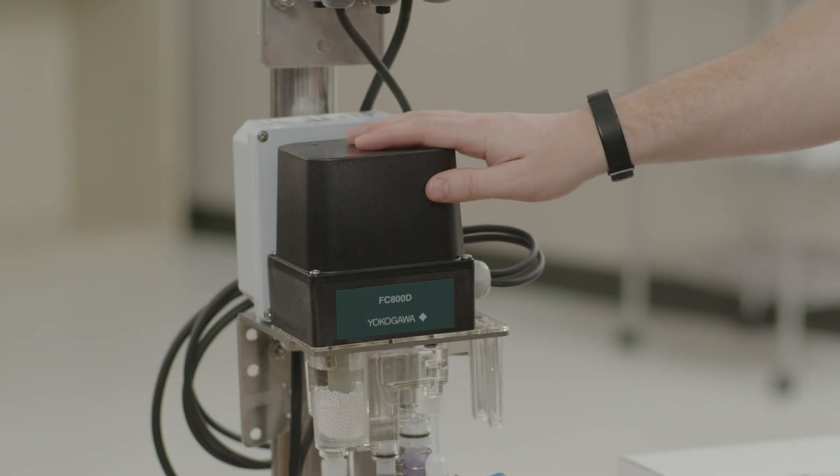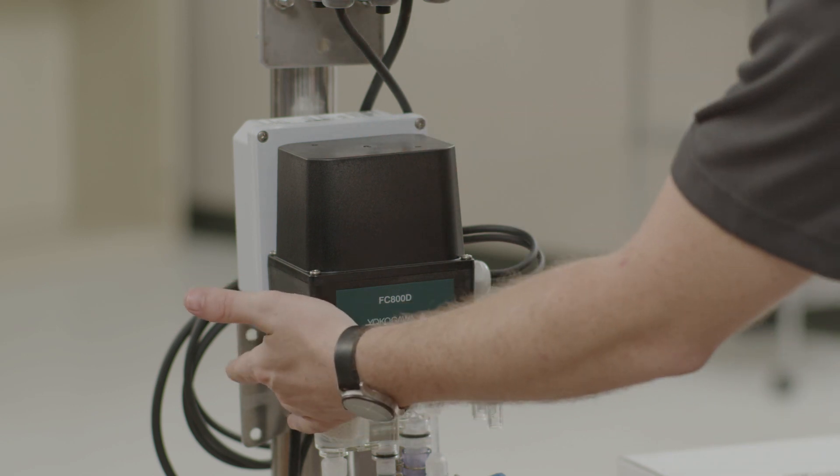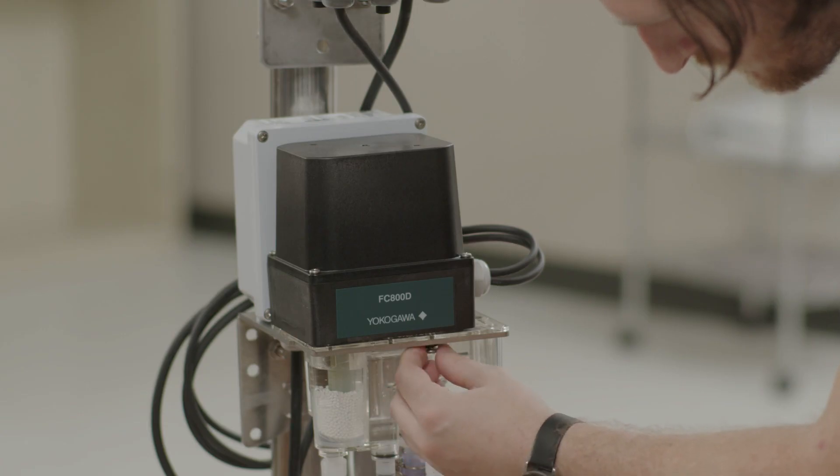With the analyzer in maintenance mode and the measurement electrode turned off, we can undo the two screws at the bottom of the flow cell. These are capped screws so they'll stay with the flow cell.